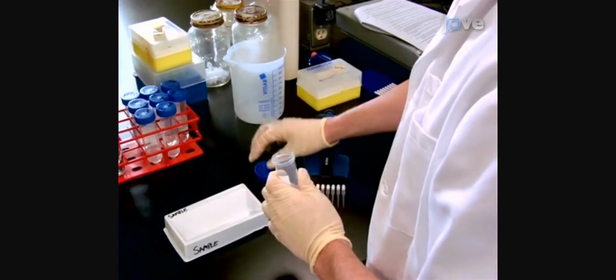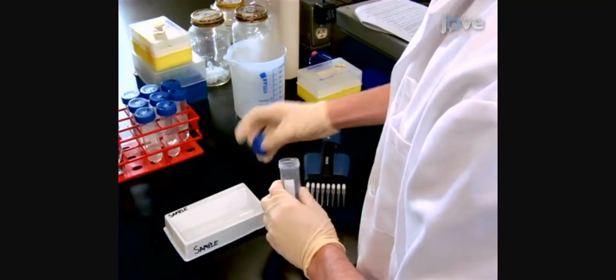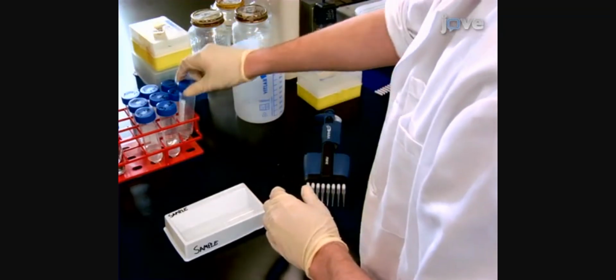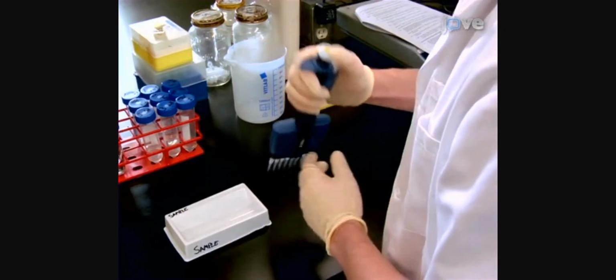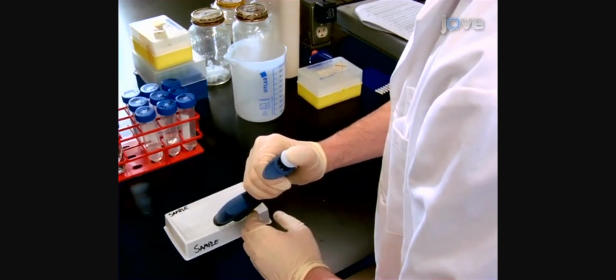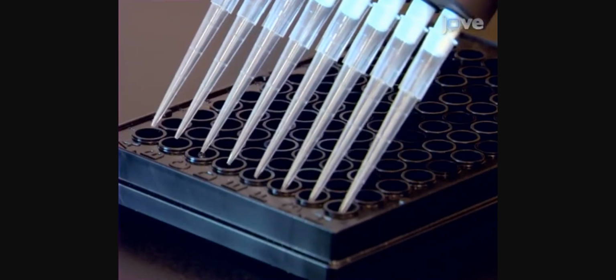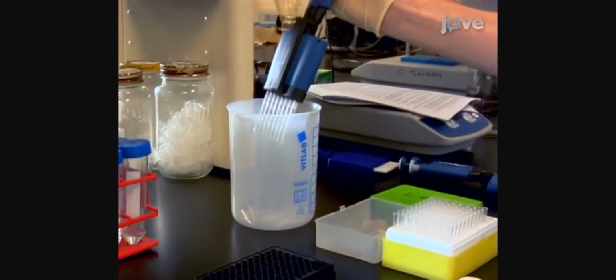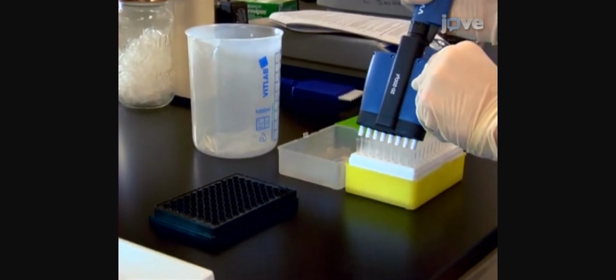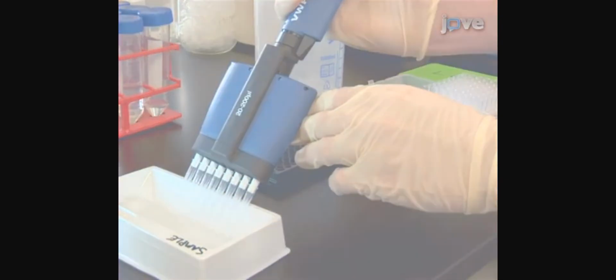After organizing a black microplate for each enzyme, following the example shown in the text protocol, pour approximately 5 milliliters of the first water sample into a pipette reservoir and use an 8-channel pipetter to pipette 200 microliters into all of the wells in column 1 of the microplates. Discard used pipette tips and repeat as needed for each water sample to fill columns 1 through 9.